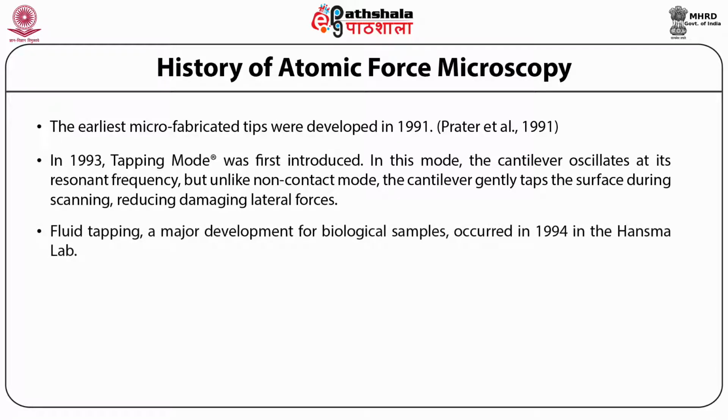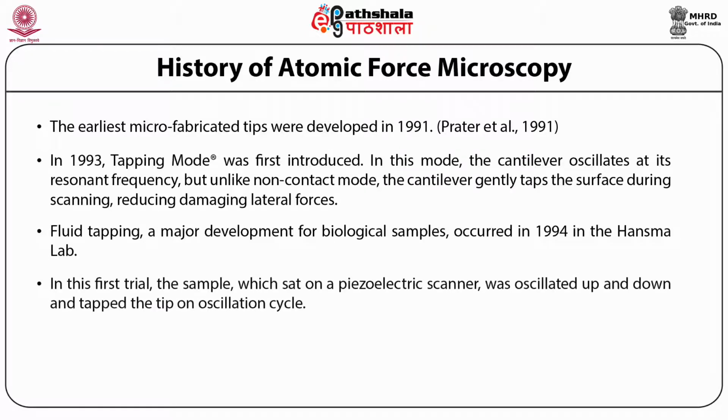Fluid tapping, a major development for biological samples, occurred in 1994 in Hansma's lab. In this first trial, the sample, which sat on a piezoelectric scanner, was oscillated up and down and tapped the tip on each oscillation cycle.